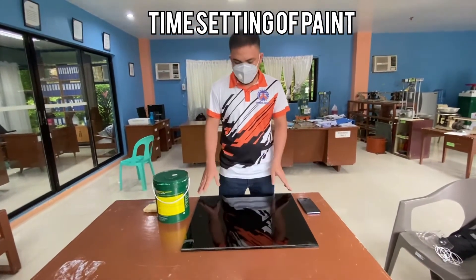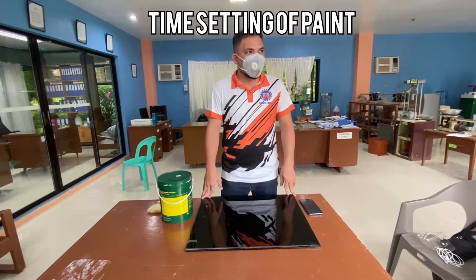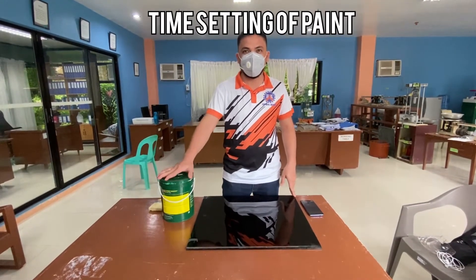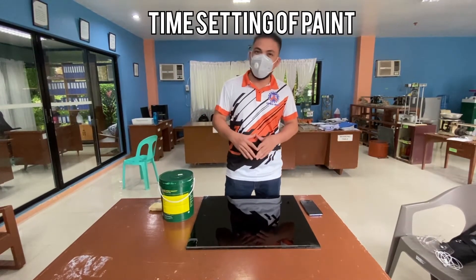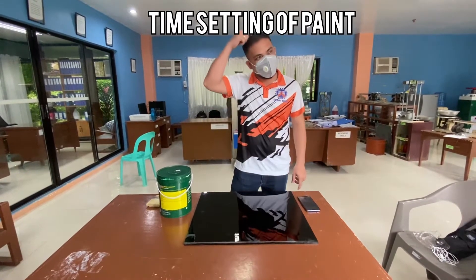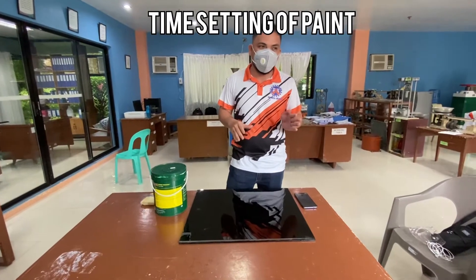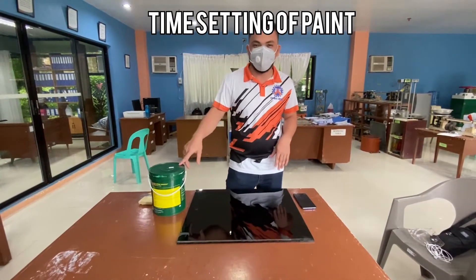The significance of this test is to determine the time it takes for a paint, some form of paint, to dry. In practical terms, for our MPBs that have been painted, we can determine how long the paint takes to dry.